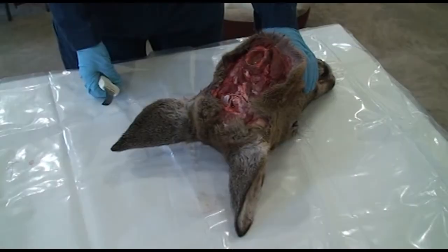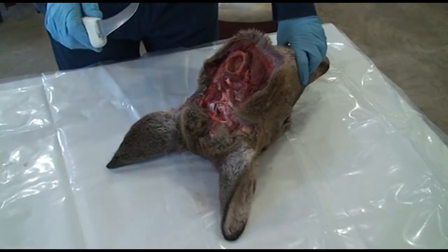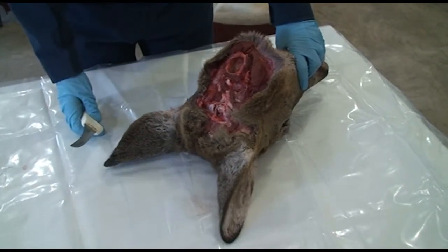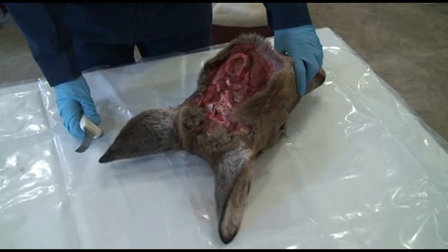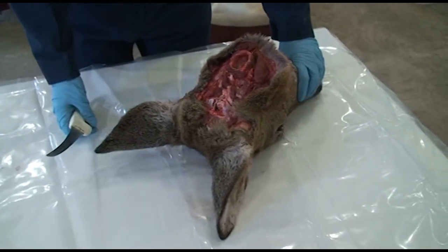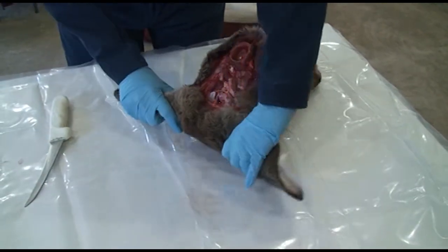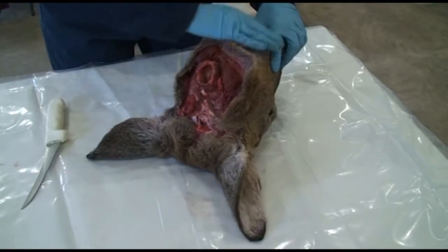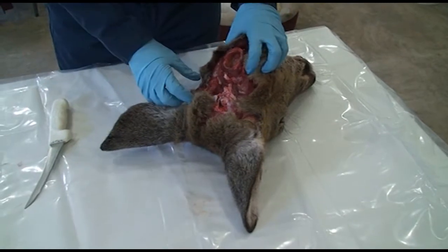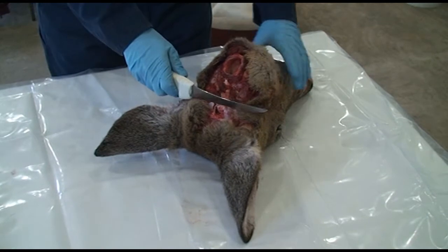To remove the head on the white-tailed deer, have the deer up on its back. If you cut the neck off, so you've got some neck attached to the head, then you can do it that way also, but it's easiest if you can remove the head while it's still attached to the deer. And the landmarks that you want to look at are the base of the ear and the curve of the jaw, and behind the Adam's apple, the larynx and pharynx right there. You want to be behind that. So that's kind of your landmark.